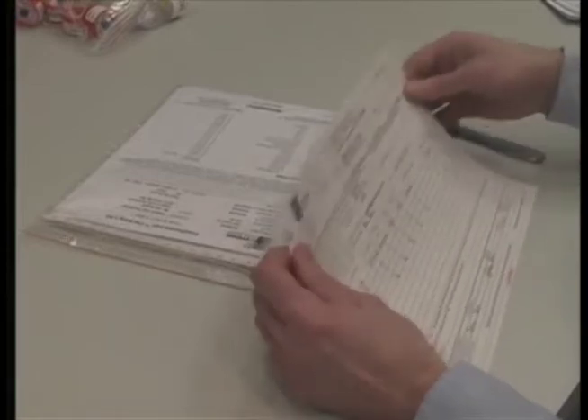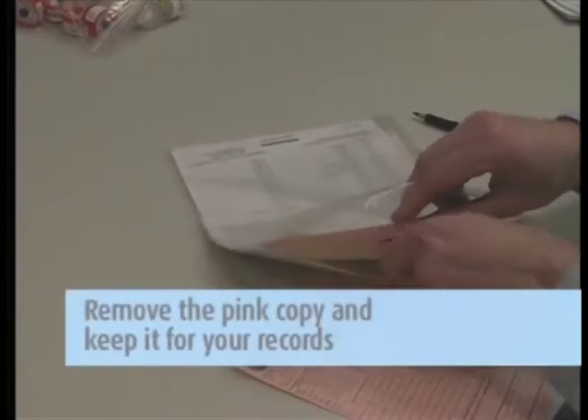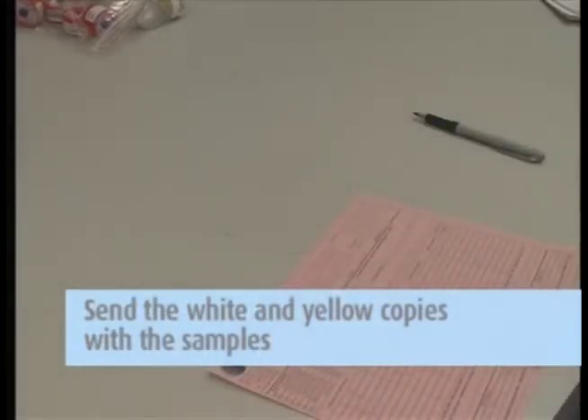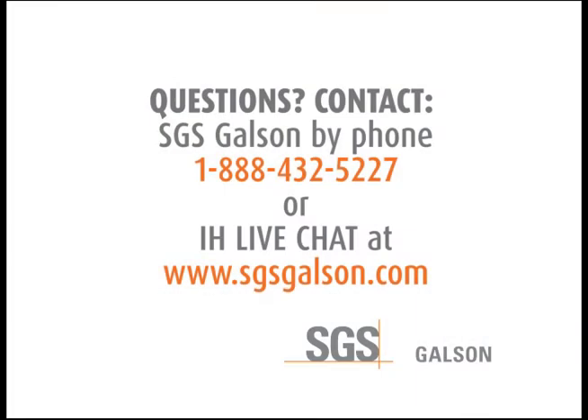Then, complete the chain of custody form. It is important that you include all the information requested in order to ensure the turnaround time of your samples. Remove the pink copy and keep this for your records. Send the white and yellow copies in with the samples to the lab in the large Ziploc bag. Questions? Contact SGS Galson by phone or IH Live Chat.